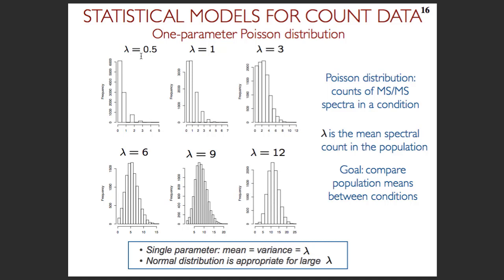However, when we have a very small parameter, which would correspond to a low protein abundance, then clearly the counts are skewed. Their discrete nature is a lot more apparent, and the fact that they cannot become negative is also more apparent. The problem for us is that we cannot really afford choosing, okay, this protein is in this situation, this protein is in that situation. I would say that in every experiment, either RNA-seq or mass spectrometry, we would always have proteins with low counts. And therefore, we have to optimize for that and work with methods which would accommodate proteins with low counts appropriately, even though some proteins may be in a situation like that.